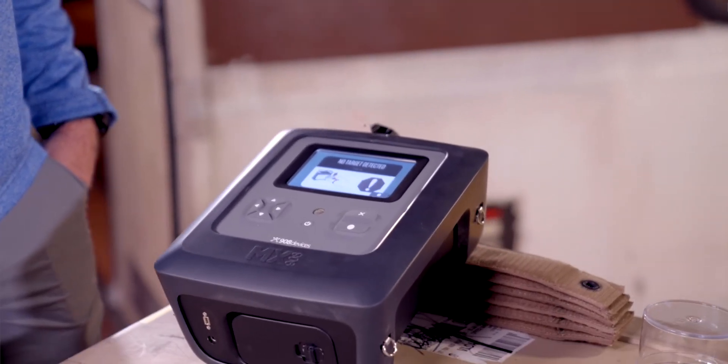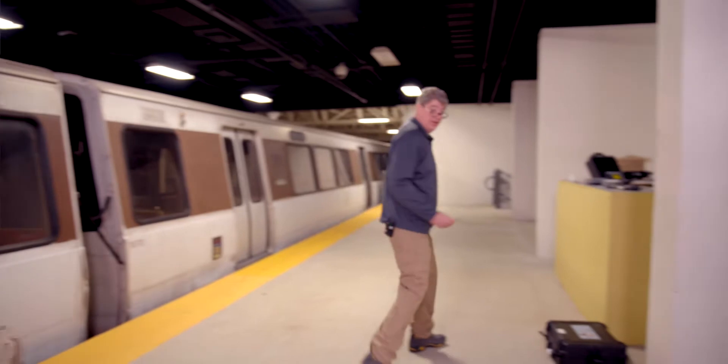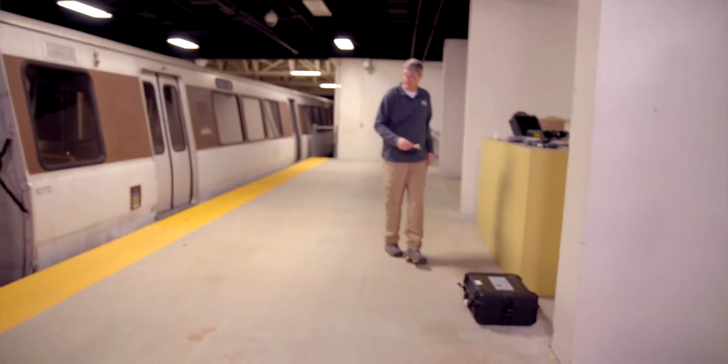No target detected. That's not a bad thing. Can we rewind? I just wanted to prove I'm right here. That's the beauty of magic cameras. Run another sample.